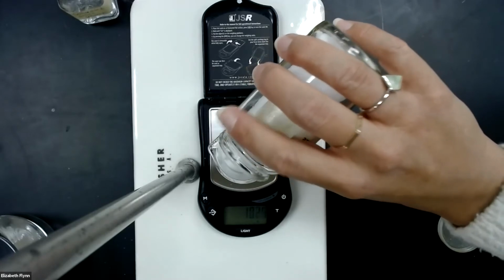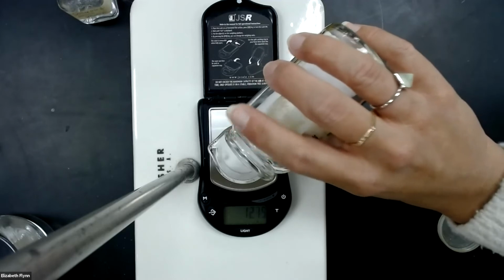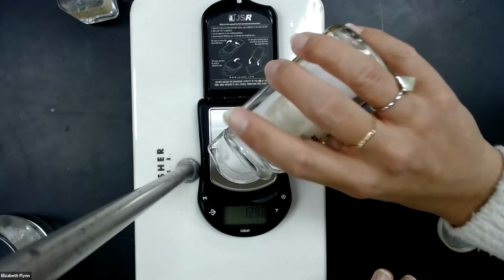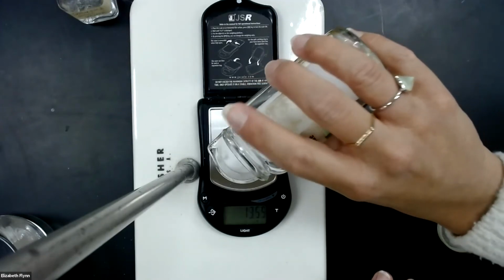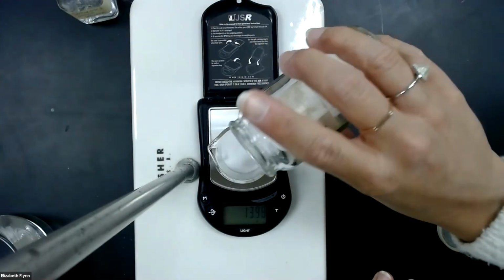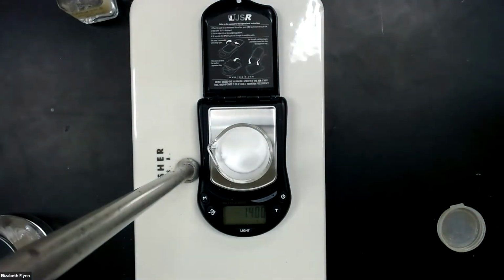Get it up to 14 grams. And I know I said 14.00, but just do the best you can, okay? It doesn't have to be exact. I wanted it to be really similar for everyone, so get as close as you can, but if it's 14.01, that is okay. So I'm almost there. There we go. 14.00 grams of table salt.